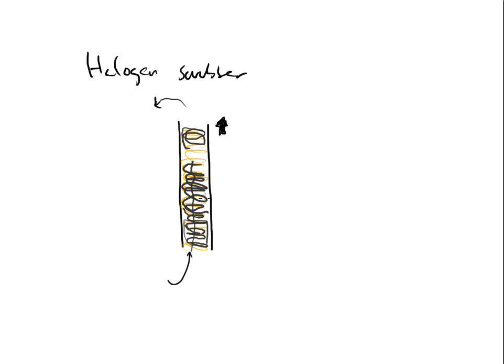So again, halogens are bad for this instrument. Halogens are bad because they will make their way into the detector and eat the metal that's located in the detector. So I want it to eat the copper here before it makes its way to the detector, and it literally kind of neutralizes it out. I don't have to worry with it, and that's the whole point of a scrubber.